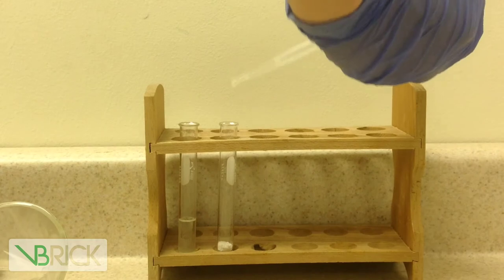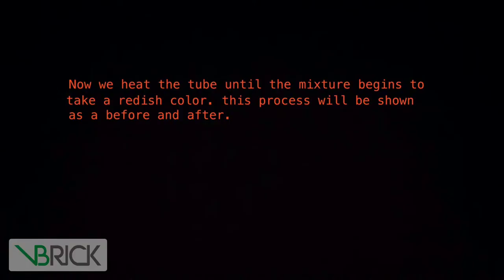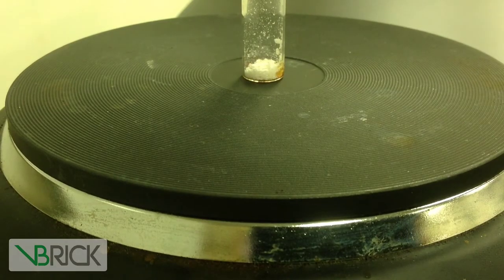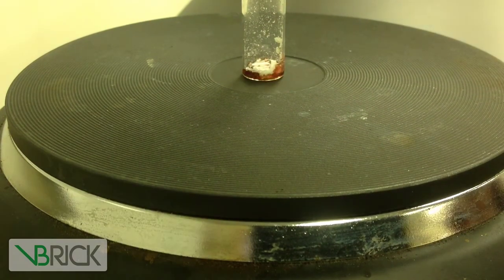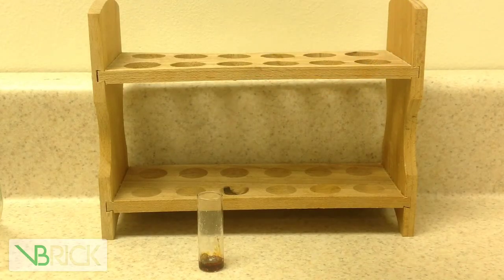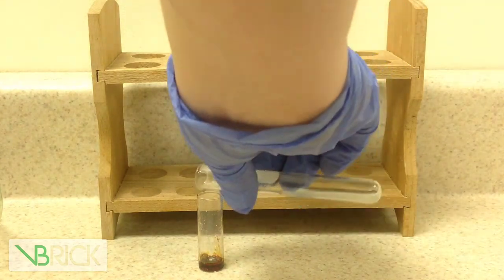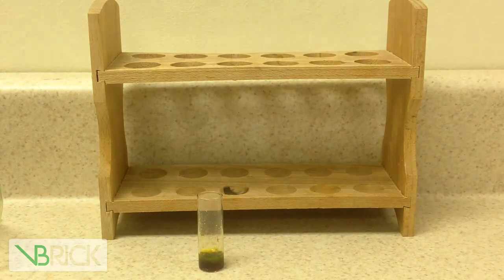Now we add one drop of sulfuric acid to the mixture. We then add about 10 milliliters of water mixed with sodium hydroxide. We'll try to dissolve as much of it as we can.